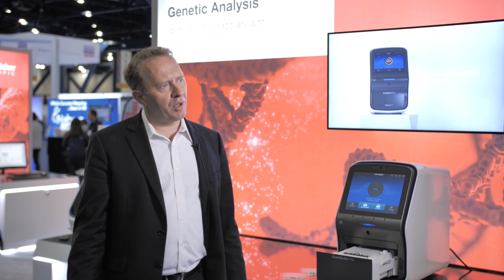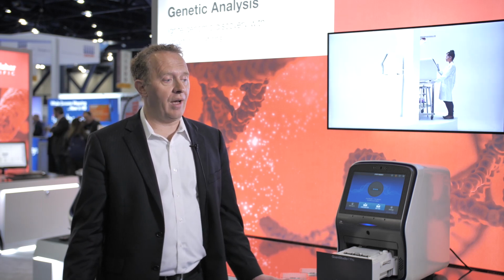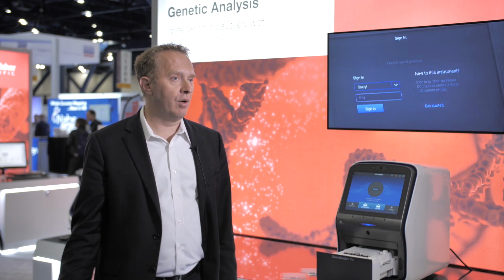Well, we're really hoping that our pipeline takes off and that we could be looking at hundreds of thousands of samples in the future. At that point, I think that we would need automation, and that would mean probably being in a 7 rather than a 6. The automation features and also the regulatory compliance issues with the 7 would be very appealing.